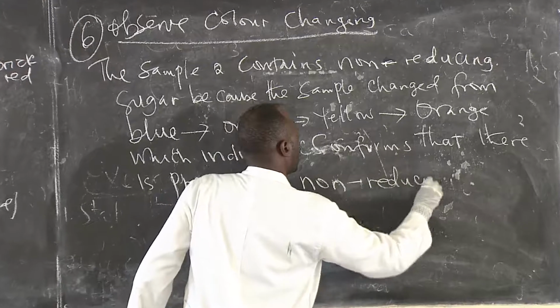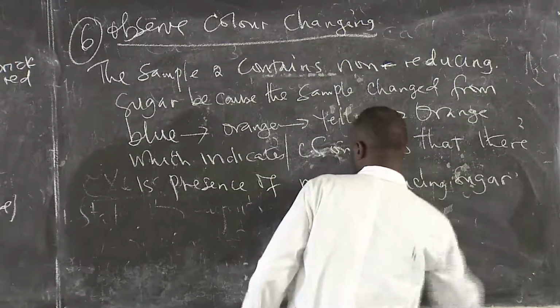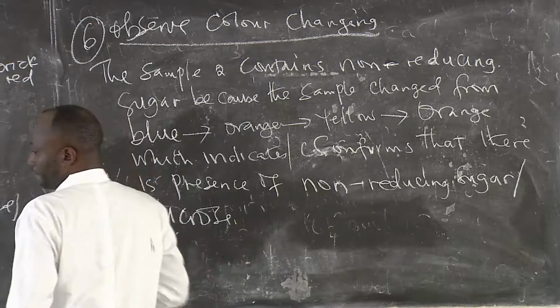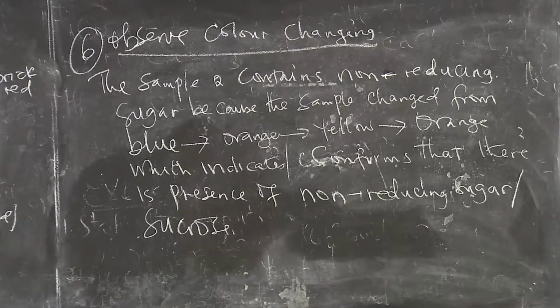Or we can say there's presence of sucrose. So I think that is the sample we had to do today.